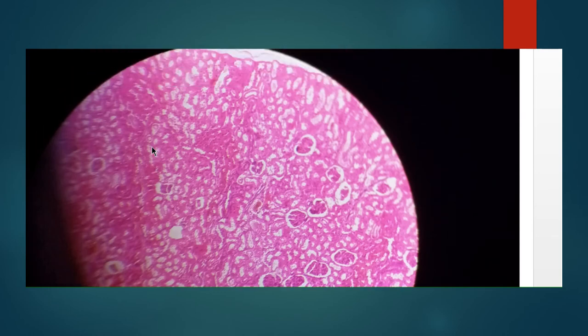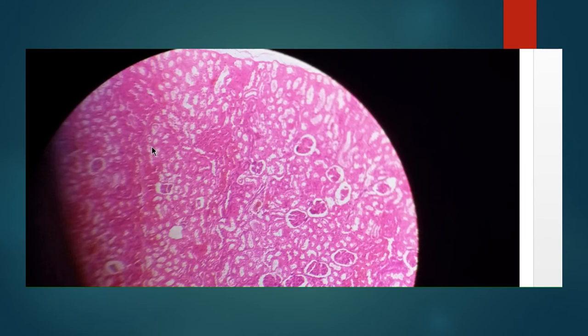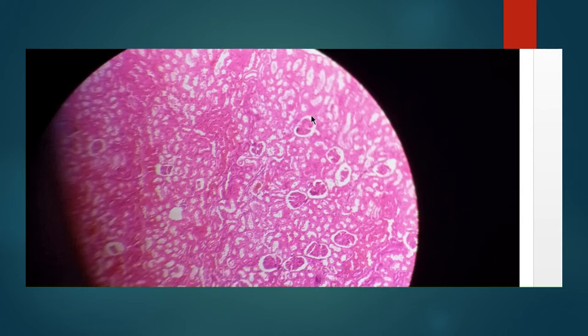Now we have moved to the next system that is called the excretory system. So how to identify the excretory system? In the excretory system we can identify the kidney. So in the first part of the kidney we can identify the cortex part, we can identify renal pyramids. In it you can identify the renal corpuscle, which consists of the Bowman's capsule.